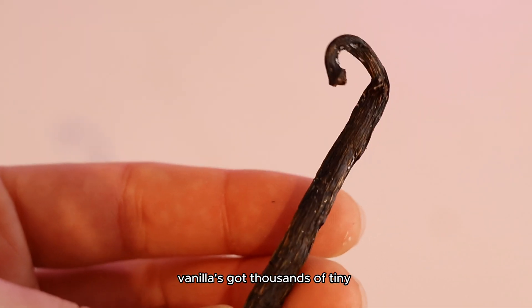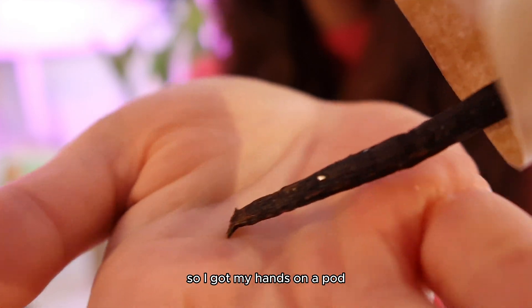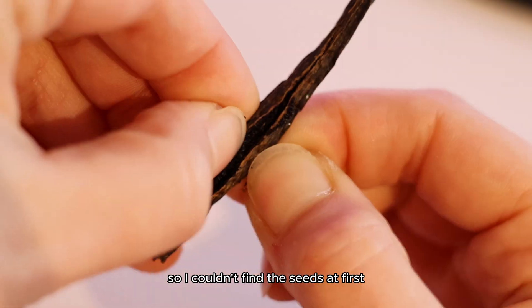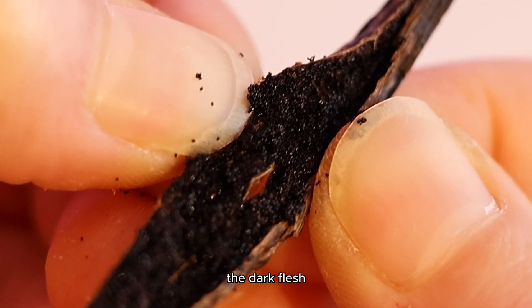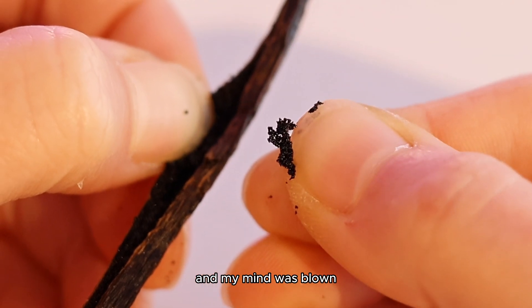I didn't realize it at first, but vanilla's got thousands of tiny seeds inside that are growable. So I got my hands on a pod to see if we could try to grow a vanilla plant. I've never opened up one of these things, so I couldn't find the seeds at first. But then I realized that the seeds are so tiny — the dark flesh inside the actual pods are the seeds. And my mind was blown.